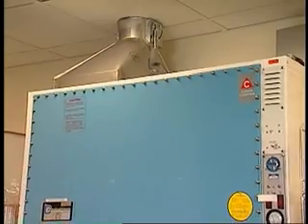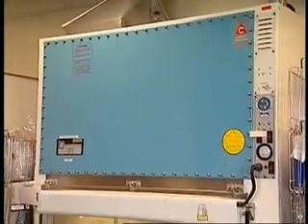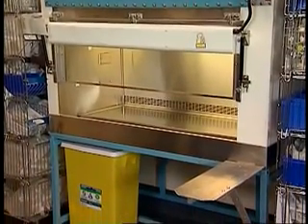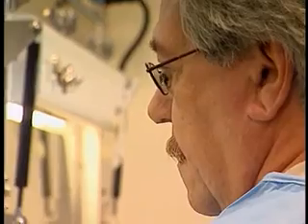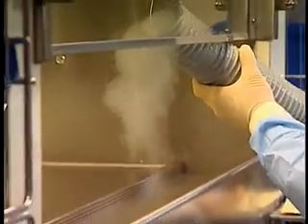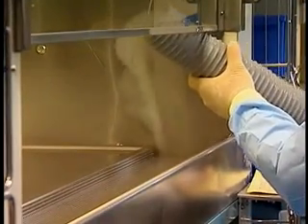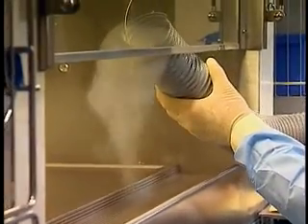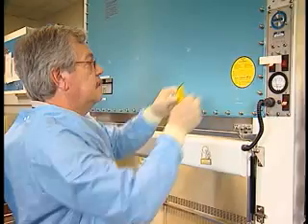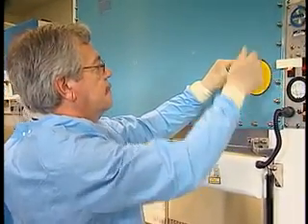A Class II vertical laminar airflow biological safety cabinet that meets required standards is necessary for handling antineoplastic products. The cabinet must be in operation continuously, 24 hours a day, 7 days a week. Ideally, the cabinet should be a type B2 or total exhaust cabinet, from which 100% of the filtered air is exhausted to the outside of the building. The cabinet must be certified by a qualified technician when installed or repaired, and ideally recertified every 6 months.